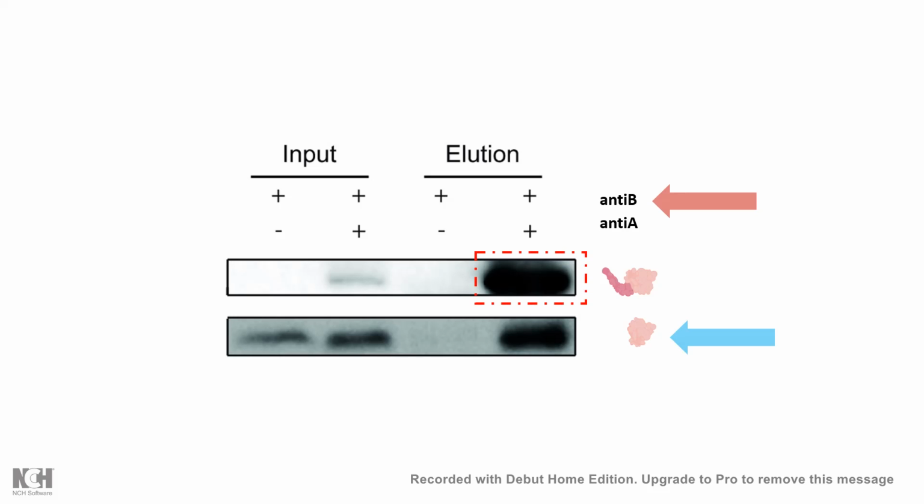You see a band. Now in the previous lane, you have a negative control, where you haven't given any antibody against protein A, so literally you didn't do any pull down of protein A. So even after giving antibody of protein B, you are not able to detect it, right? Because we know that in this Western blot we would detect only if we have the protein interacting with my protein of interest. Otherwise, we won't find it.